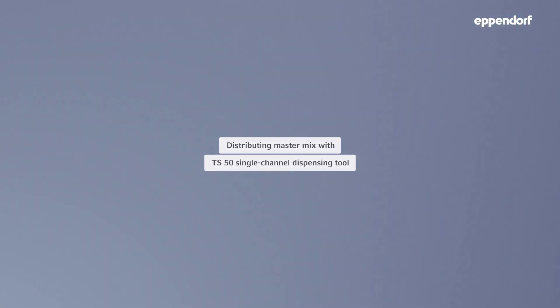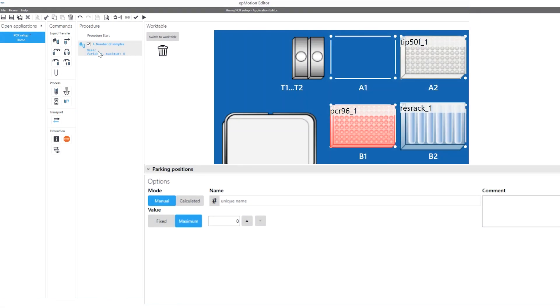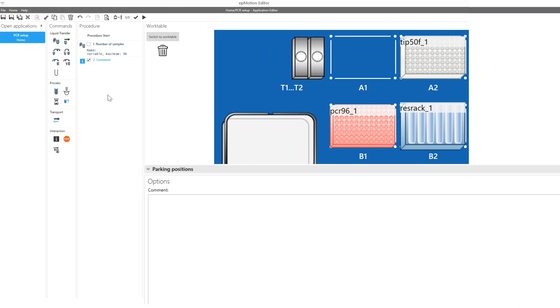Programming a method to set up a PCR reaction is easy. It typically starts with the distribution of the master mix from a reservoir vessel into a PCR plate. You then define the total number of PCR reactions you would like to set up using the number of samples command. You can add an optional comment command to indicate the purpose of the following liquid transfer command.